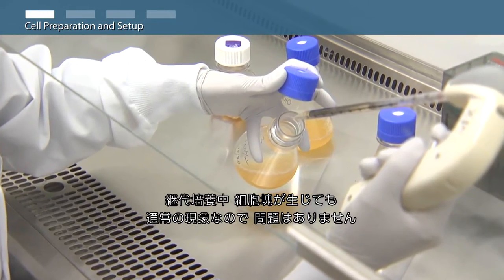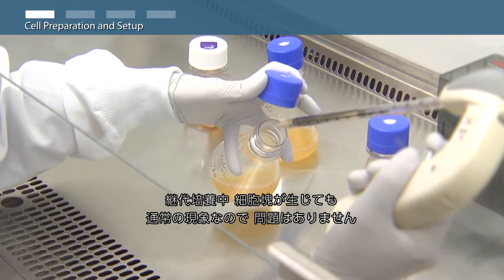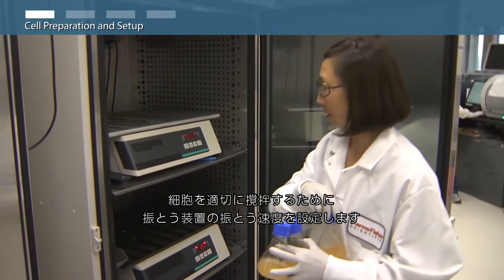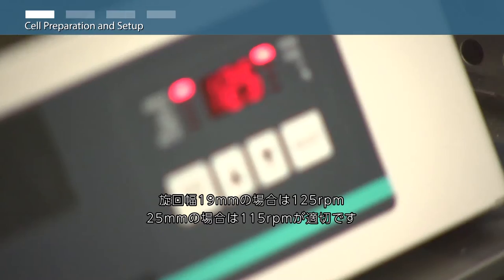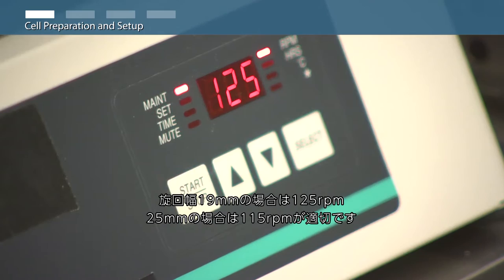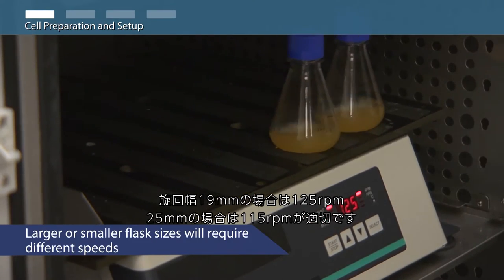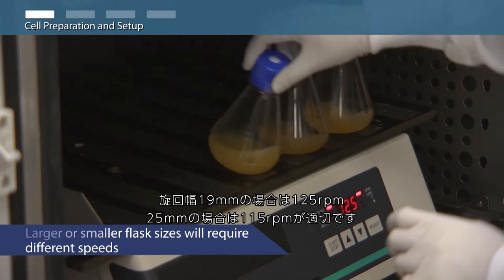Some clumping of cells is normal during routine subculturing and is not of concern. Ensure shaker settings are correct to provide appropriate cell mixing: 125 rpm for shakers with a 19 mm orbit and 115 rpm for shakers with a 25 mm orbit.